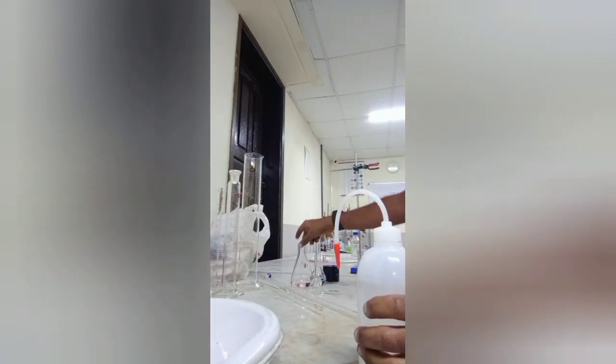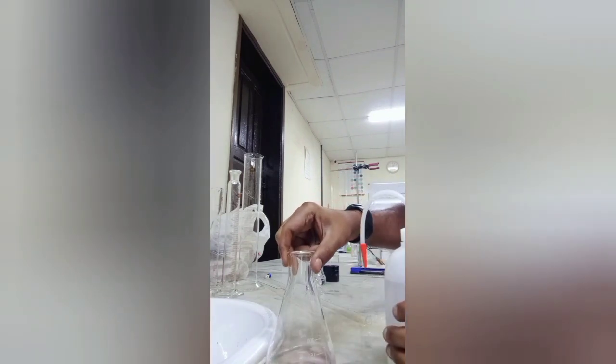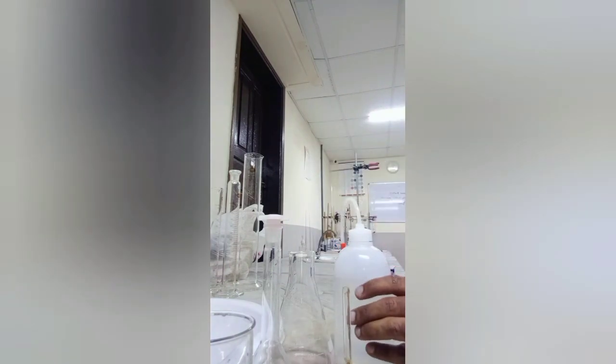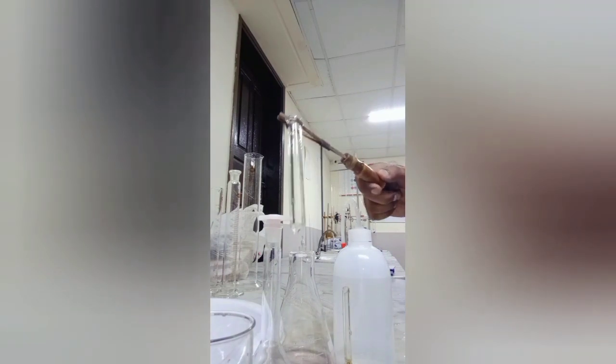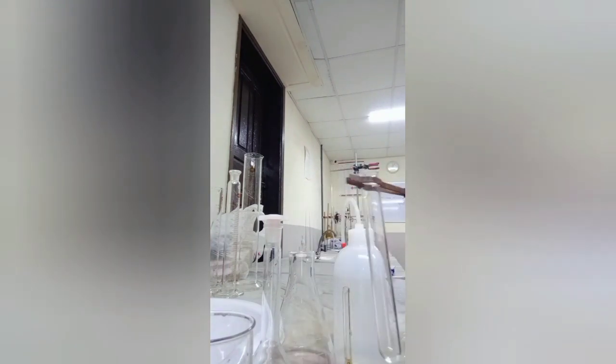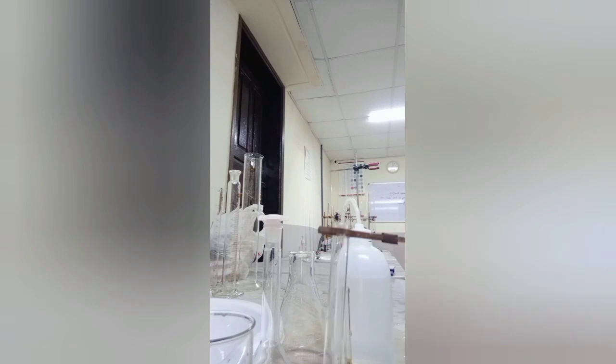And you want to know what glassware we are using. Conical flask, standard flask, beaker, funnel, wash bottle, test tube stand, or test tube holder. This is the test tube holder. This is the test tube holder with the test tube. And you will be provided the test tube stand. I didn't show the test tube stand because it comes under salt analysis. So finally we will see the entire calculation part and the written part we wrote.